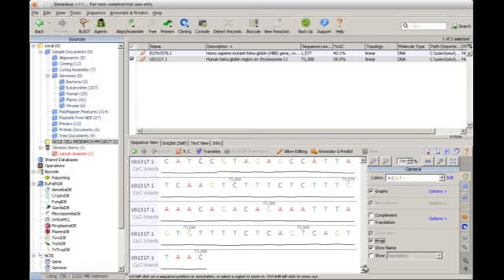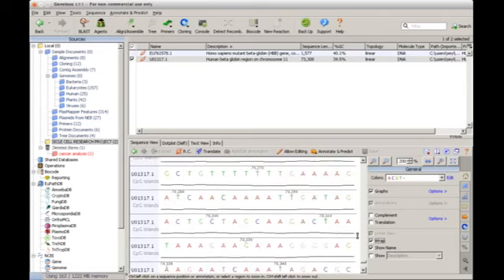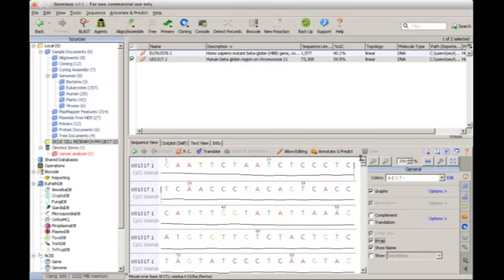So you keep going. This is the last nucleotide base in the sequence, and the last one is 73,308 nucleotide bases in total. Now mind you, what we are viewing is under sequence view. So you are actually viewing this particular sequence. That's the first thing you do.